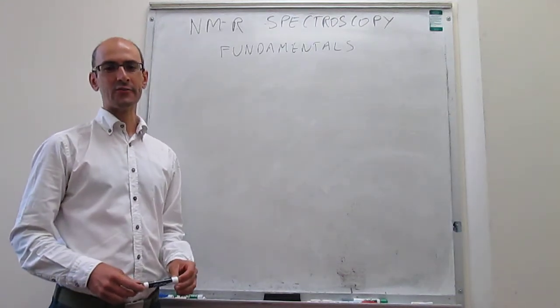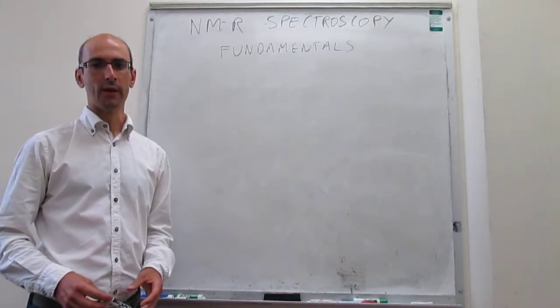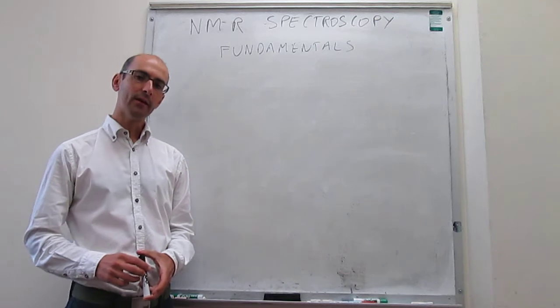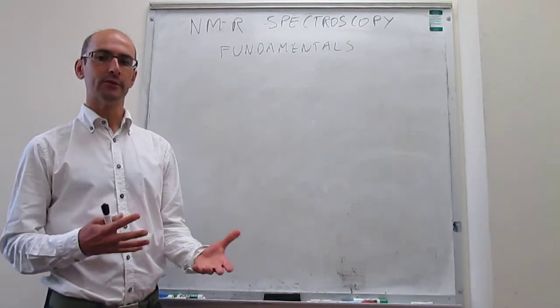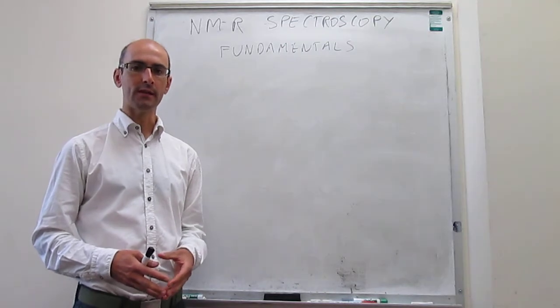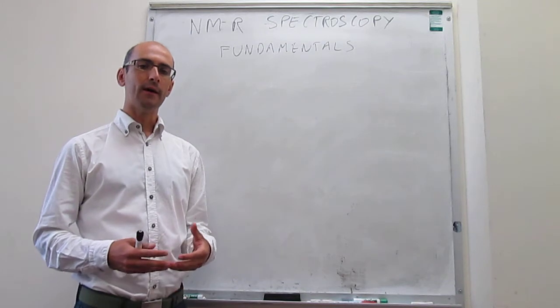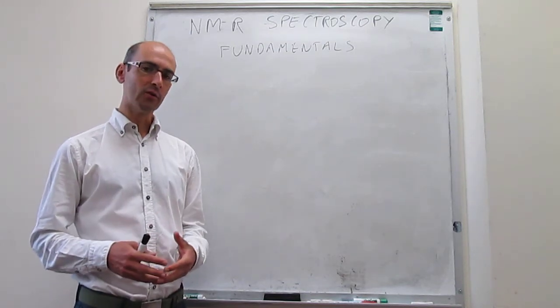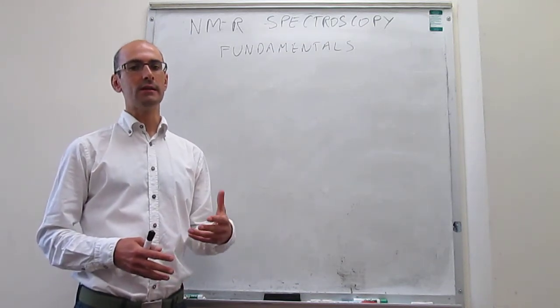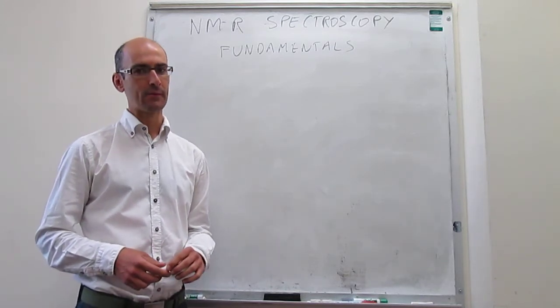This video provides an introduction to nuclear magnetic resonance spectroscopy, which we will call NMR spectroscopy. NMR spectroscopy is similar to and different from the other two types of absorption spectroscopies that we will study here, which are infrared and UV-Vis. The motion that is excited during nuclear magnetic resonance spectroscopy is the nuclear spin. So that's where we start, trying to define what the nuclear spin is.